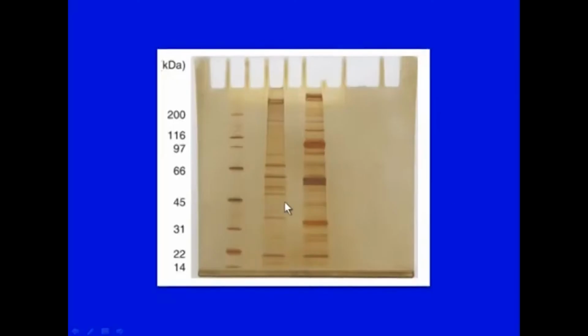Photo development can also be done; light could be used to reduce the silver ions to metallic silver. So, this is how the gel will look when you have silver staining, and like I said, it has a very high sensitivity, or the highest sensitivity, much more than the Coomassie brilliant blue staining.